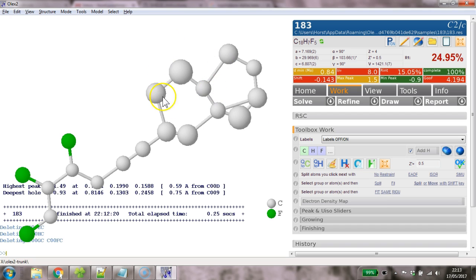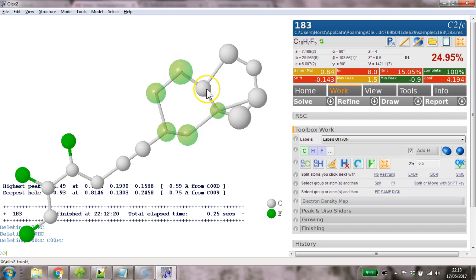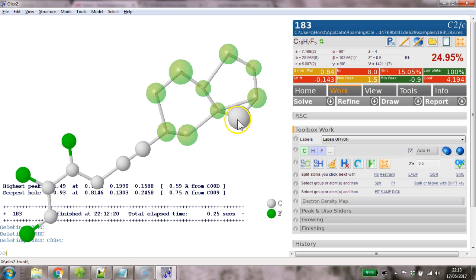Now this isn't going to refine very well. So we need to put a constraint on it and we're going to use the affix constraint. I'm starting at the alpha carbon here and I'm going round in a figure of eight. And oops, click on that, click on that. And it's the affix 116.